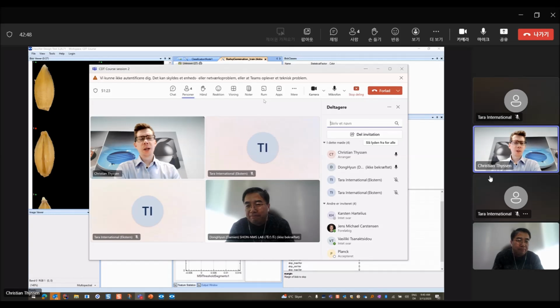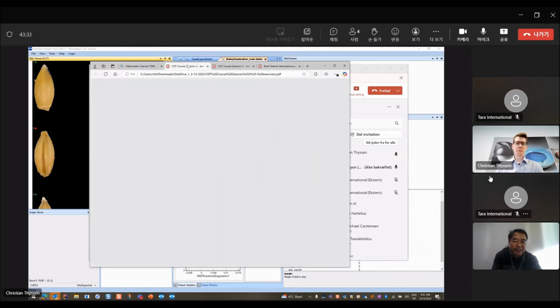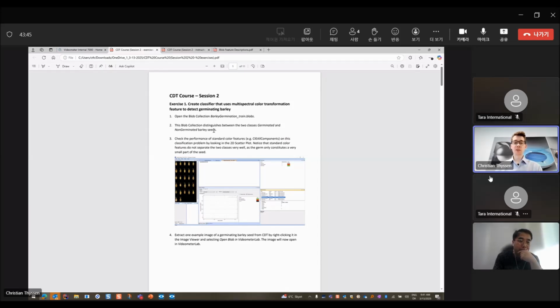So you want the exercise first? Yeah, I mean after your presentation, maybe you will give the time that we need to practice with the exercise. But instead of that, I recommend you just show us the exercise protocol. Okay. But the thing is, in my opinion, it's also good that you do it yourself, because I could show everything, but then people might not remember. So it's also good you can follow the instructions of the exercises to remember it. Yeah, but please ask the other attendees. That's my opinion. Okay. But if you follow this exercise here, it's exactly the same as what I just showed.